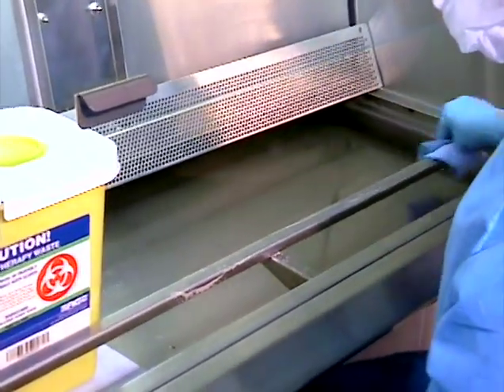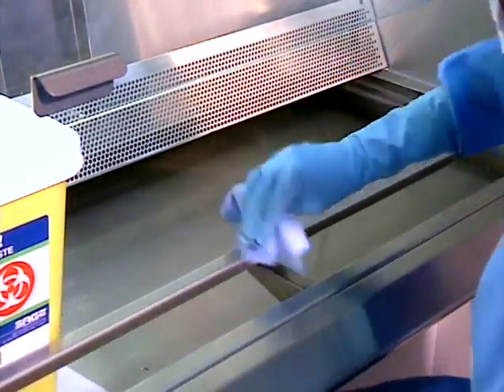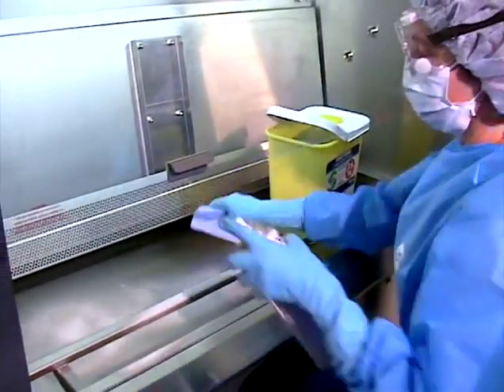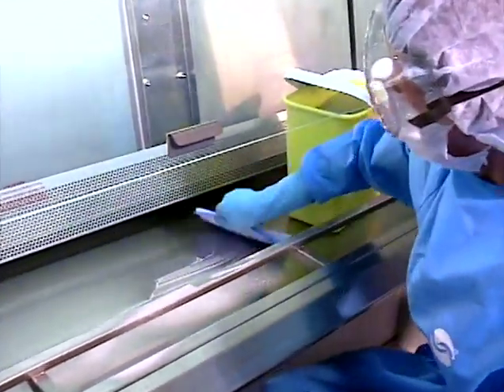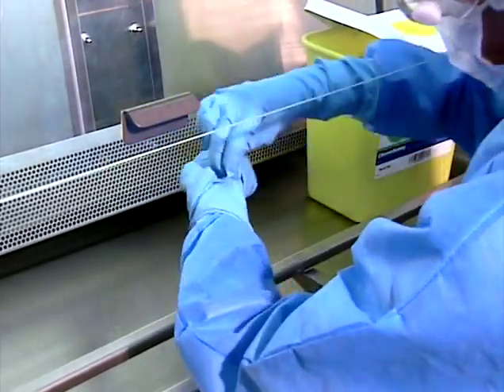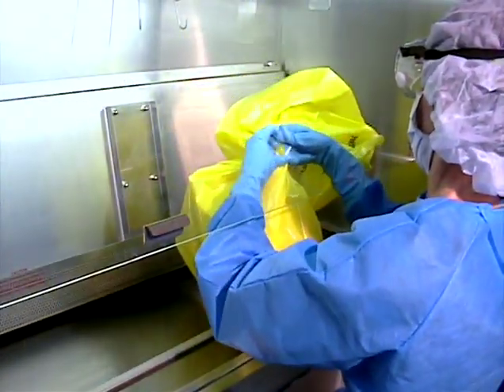When all of the under tray except the place where the waste container is sitting has been cleaned, move it to a clean area and dispose of the mat as before. Clean the area where the container was sitting. Remove the outermost pair of gloves and place them in the waste container. Seal the container and place it in the bag, which should then be sealed and disposed of in the chemo disposal container outside the hood.